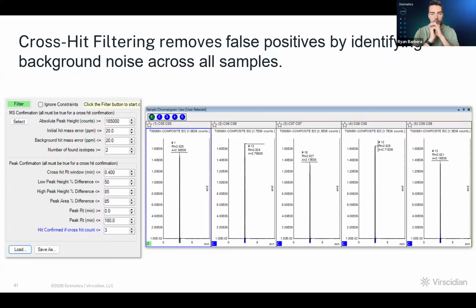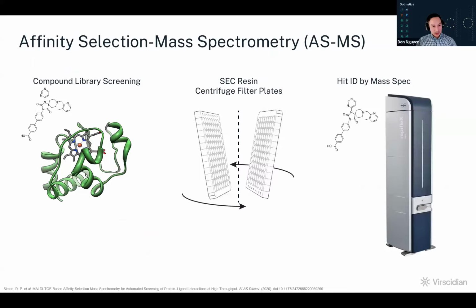Yes. Okay. Next one. Can this work on other ASMS approaches like with MALDI? MALDI. Okay, so this is actually an interesting question. This is a paper that Boehringer Ingelheim had put out a few years back. They moved their ASMS activities outside of the conventional 2D LCMS, right? And they plugged in their MALDI into an HTS line.